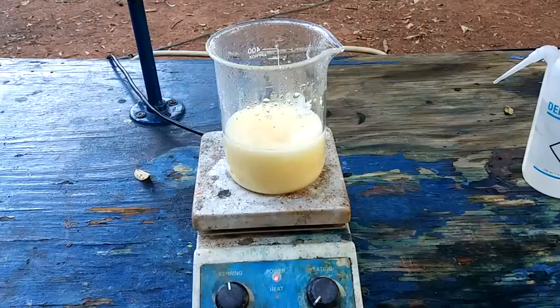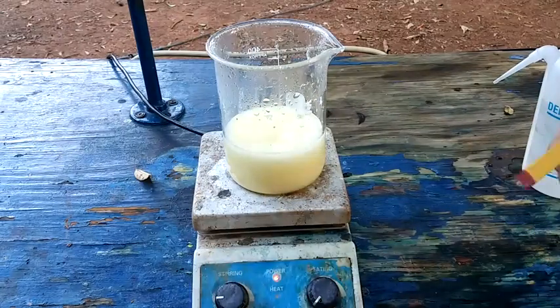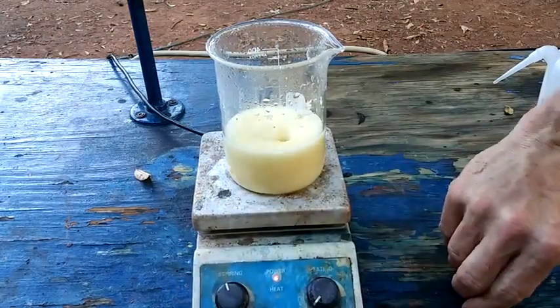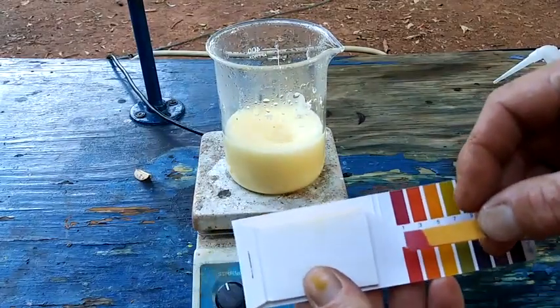Alright, at this point I'm going to go ahead and check the pH. This should be very alkaline. No, it is still very acid. Showing a pH of about 1 still. Let's see if you can see that.